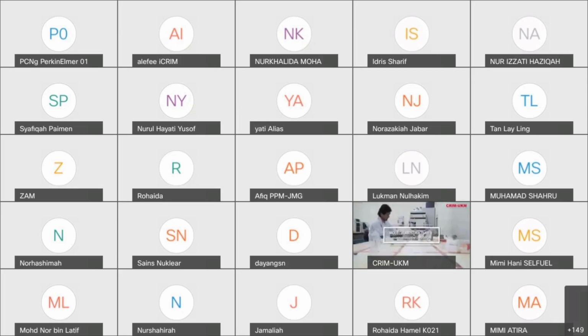Molecular Structure Characterization Lab is equipped with liquid chromatography mass spectrometer, TOF, nuclear magnetic resonance, NMR, gas chromatography mass spectrometer, automatic polarimeter, FTIR, HPLC.